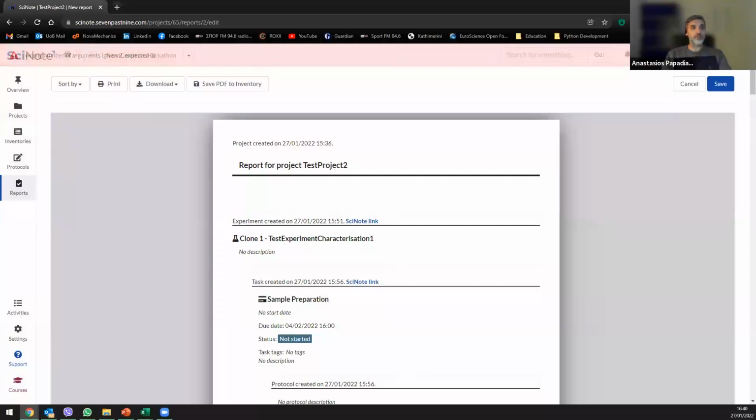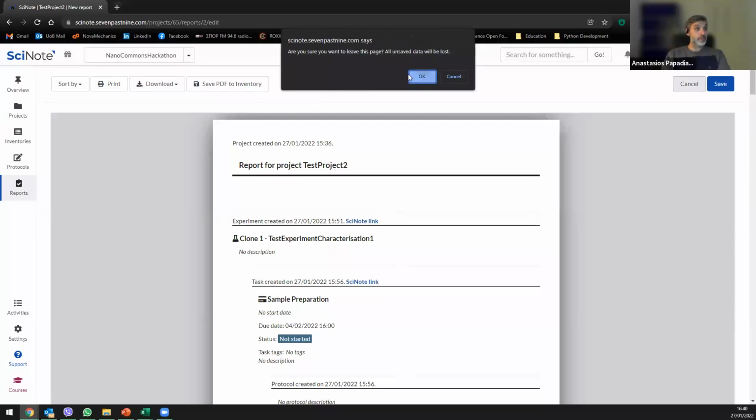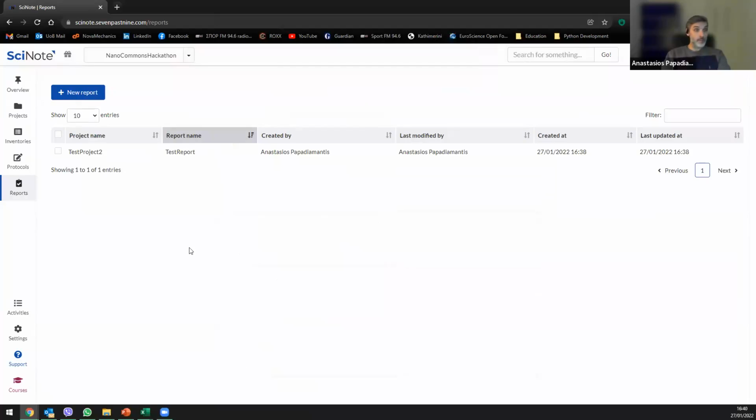Okay, I don't know what's going on. We'll check it with Thomas and fix that. You can download it as a PDF or a docx report, as a Word file or a PDF file, and so on. Okay. And so you can have your report here, and you can download it and play with it accordingly.